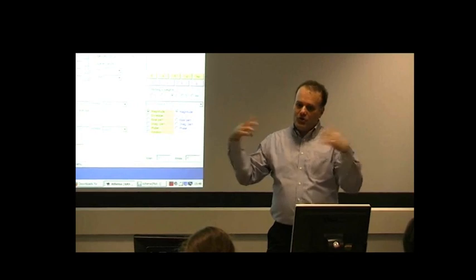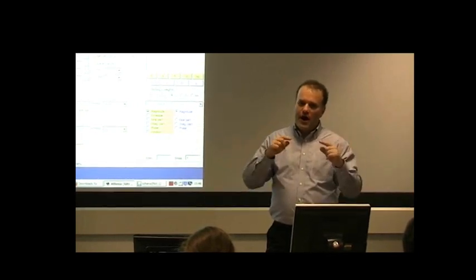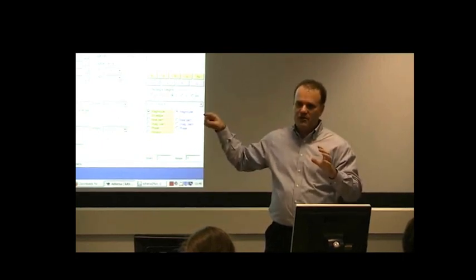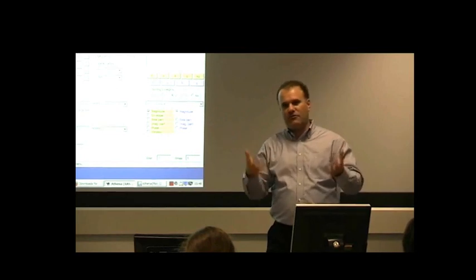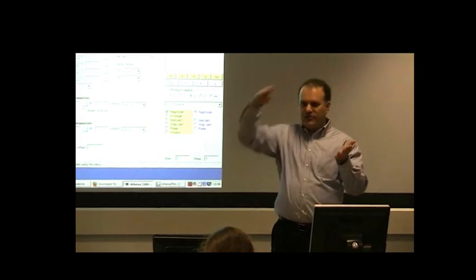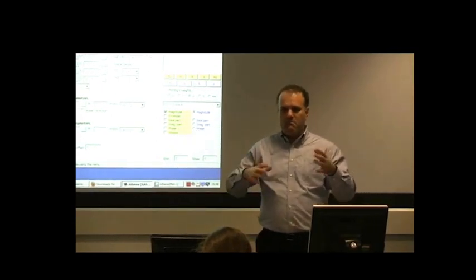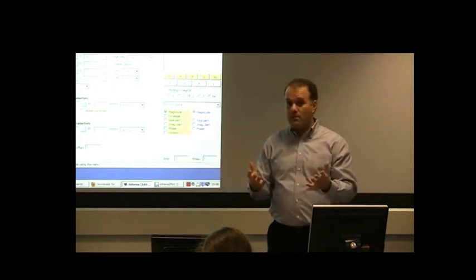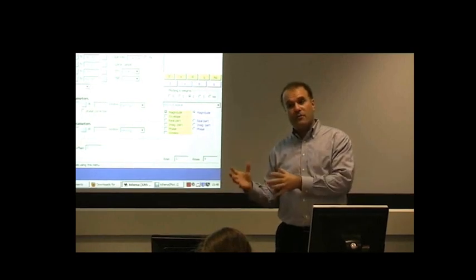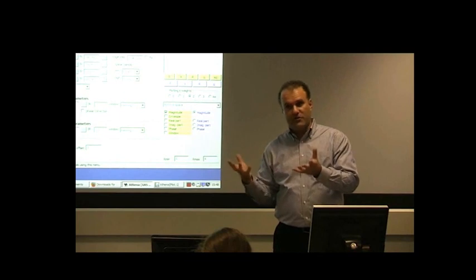If you don't have other atoms around, you do not, with an asterisk, have any fine structure. And the asterisk is that there are some physical phenomena that do lead to some structure beyond an edge step with an exponential decay. But at the level that we're talking about right now, the background is the part that has just to do with the absorber, and the wiggles are the part that have to do with the interaction between the photoelectron and the rest of the world, if there is a rest of the world.